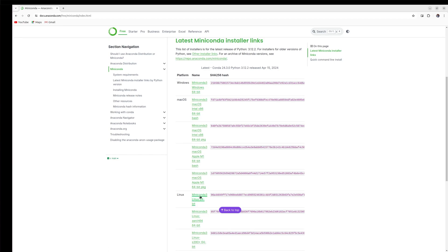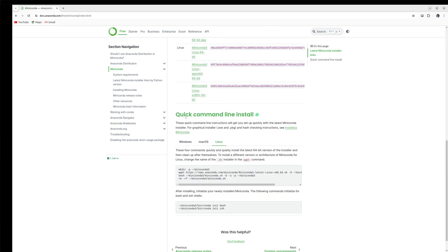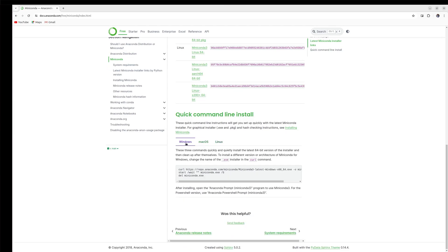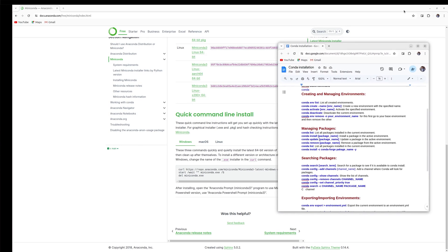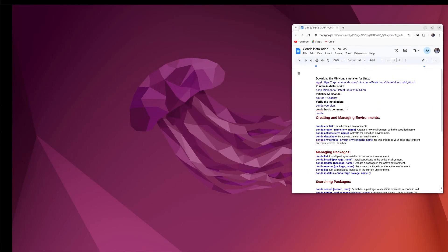I already downloaded the Linux version, and here are the quick command lines to install Miniconda for Linux, Mac, and Windows. You can follow these commands on your system to download and install Miniconda. For Mac, you can also download the software and install it very easily. I already installed it on my system, so I will provide the command line to install Miniconda so that you can install it easily.